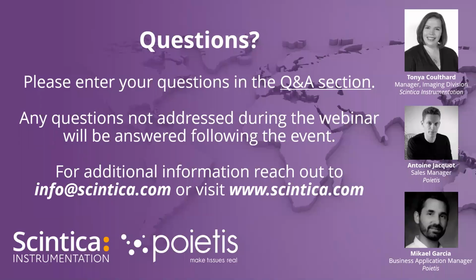An interesting question came through. You showed that UV lamp in one of the first slides of the hardware being used. If the UV lamp is used for cross-linking different printed compounds, and there's residual compound in either the extrusion or the inkjet heads, would it not also be affected by the UV light, just due to the close proximity?